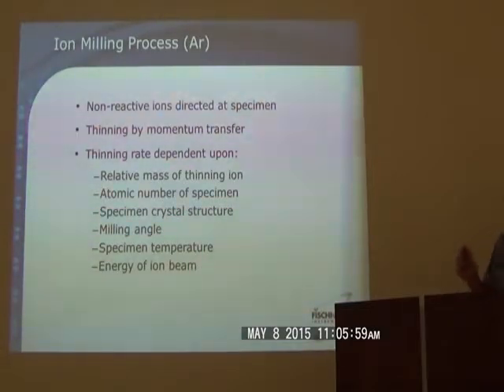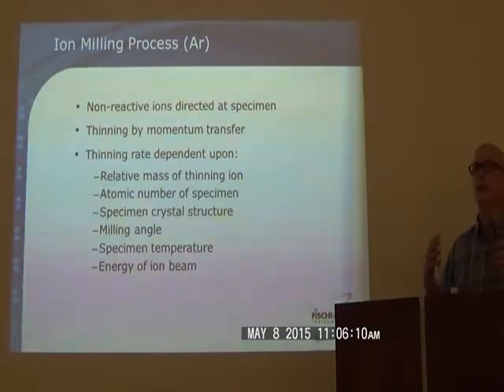Now, let's talk about commercializing an instrument and using the sputtering process to our advantage. Terminology now changes to what can we do to ion mill material. And where that came from is just, you guys in the back. Are there any guys from the back? Well, in the back we have milling machines, for instance.